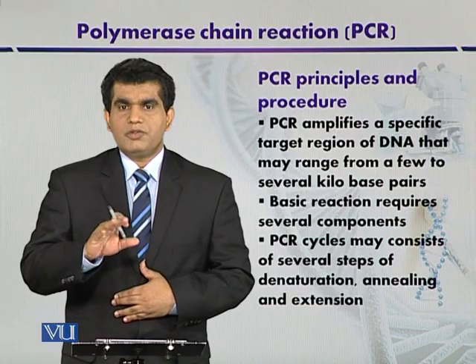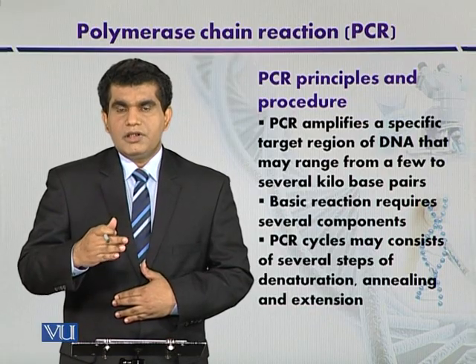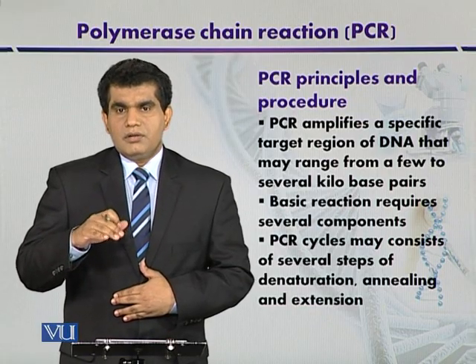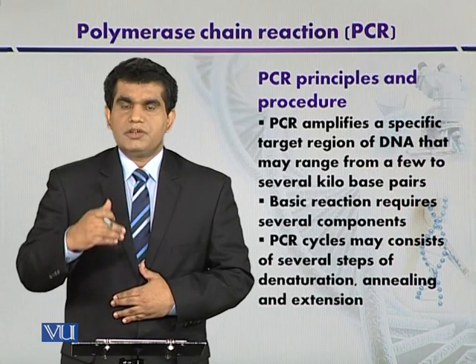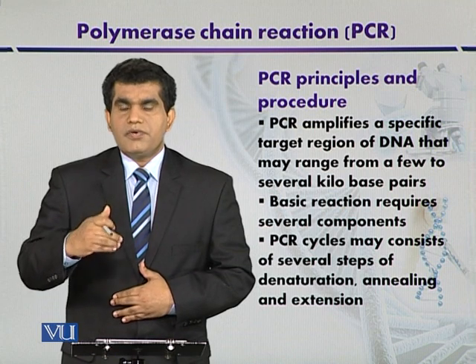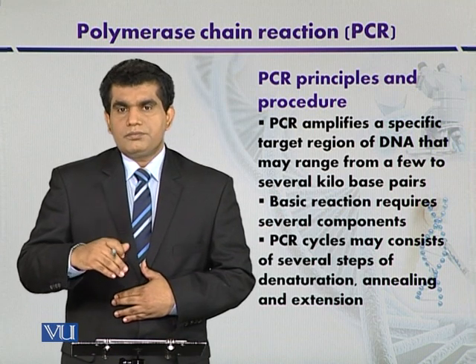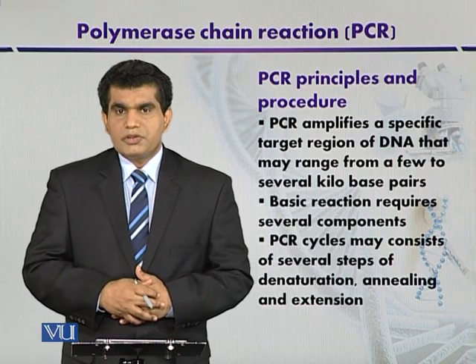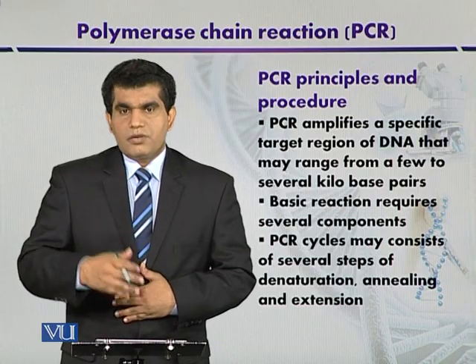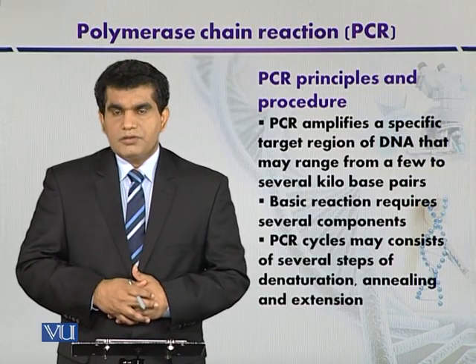तो उसमें हम इसको इंक्यूबेट करते हैं, and after placing this in the thermal cycler, the reaction mixture is subjected to different types of temperatures. Mainly three main temperatures are used, and now we are going to discuss them one by one.